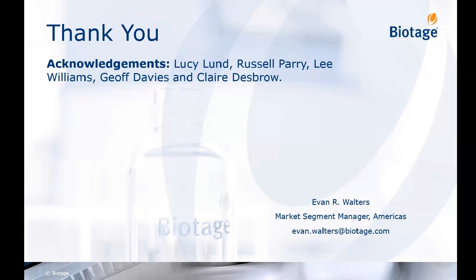However, I will say the positive pressure does make a huge difference, and we will have more info on this. The nice thing about the positive pressure is you can very finely control the speed at which your samples are processed through the column, which makes a difference in terms of cleanup and cleanliness. So when you break it down, the positive pressure manifold, the manual one, in terms of cost and investment, is not expensive. It might be a little bit more than a vacuum manifold, but it is worth the extra investment.